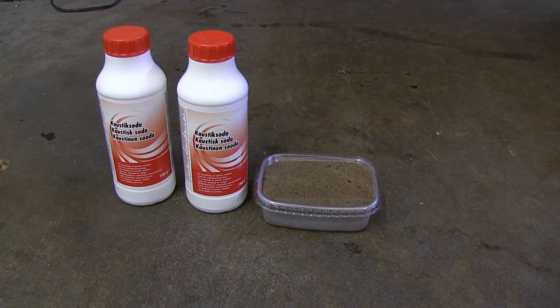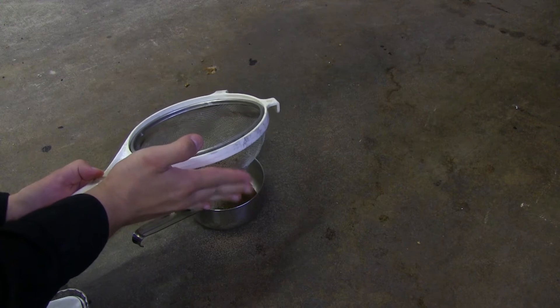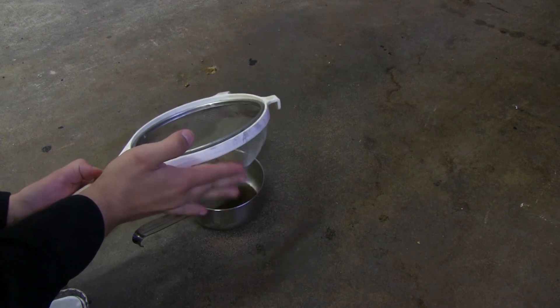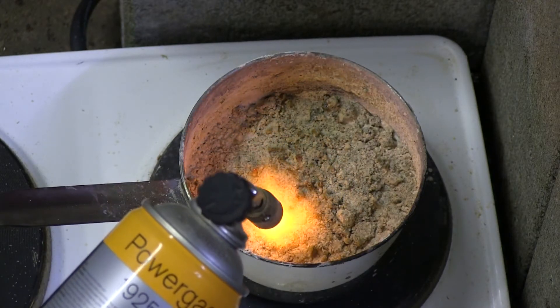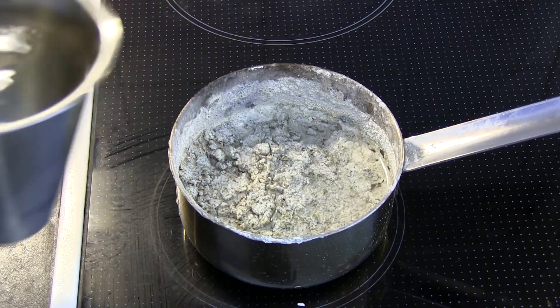First, get the reagents: sodium hydroxide and sand. Clean the sand by sieving and maybe using an acid to get the acid-soluble parts out. Dissolve reagents and boil the water out so that there is as much contact area as possible between reagents. Once dry, heat above 320 degrees Celsius.